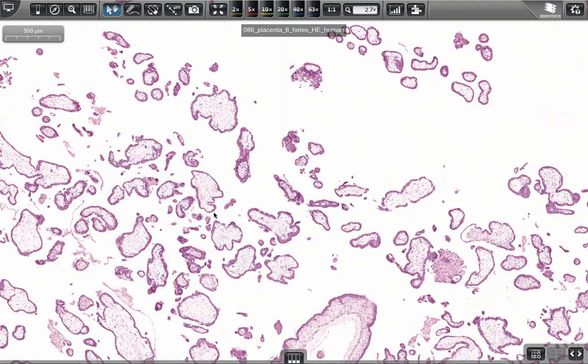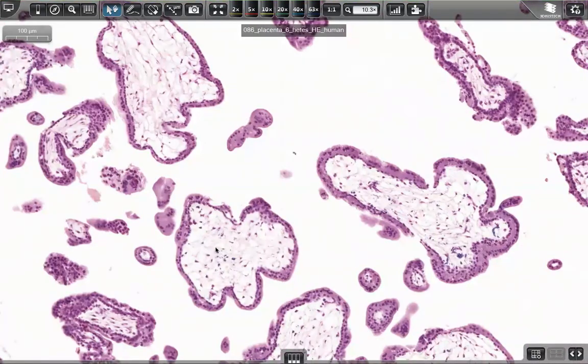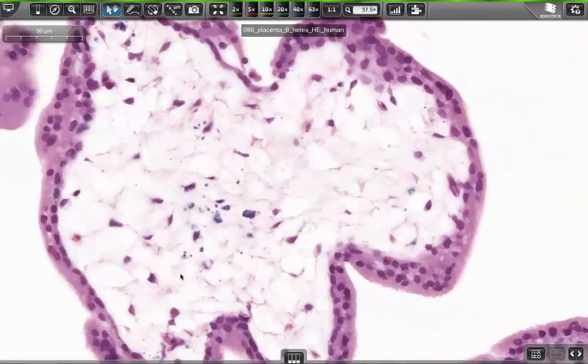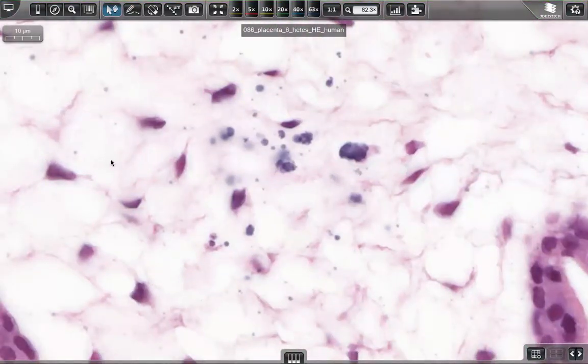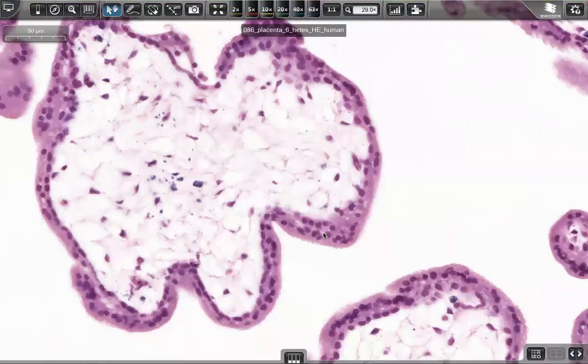Secondary villi, we can see here now, are the typical appearance of secondary villi. Here the villi represent a mesenchymal core, having typical mesenchymal cells. You remember these are sometimes triangular shaped, having long processes. So when we have trophoblast cells externally and the core is formed by mesenchymal cells, that is a secondary villus.